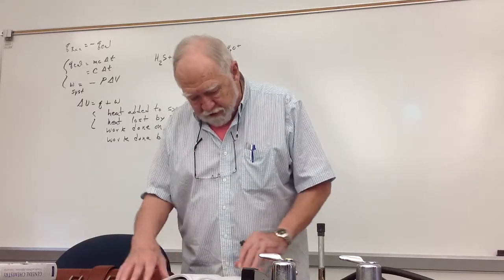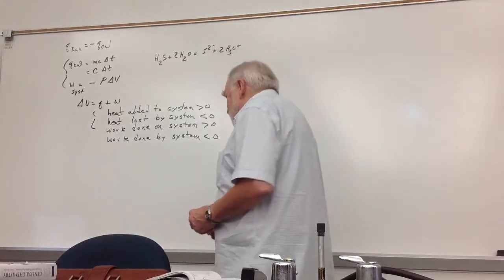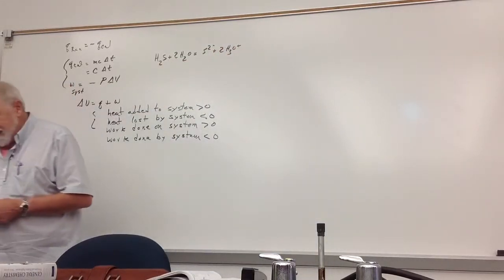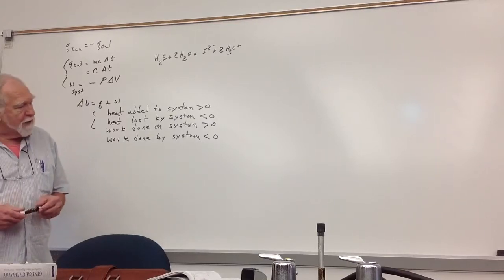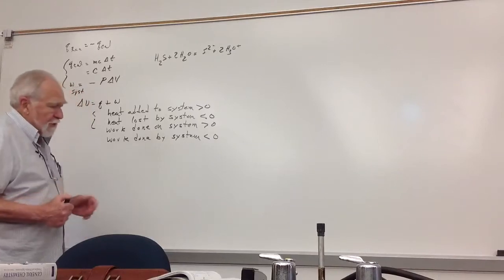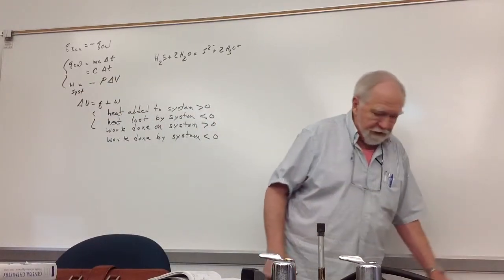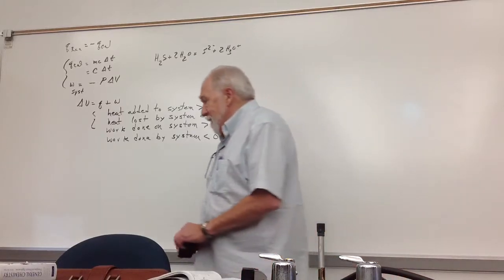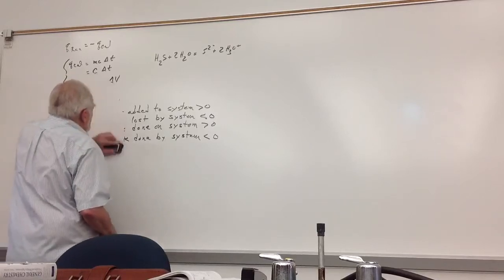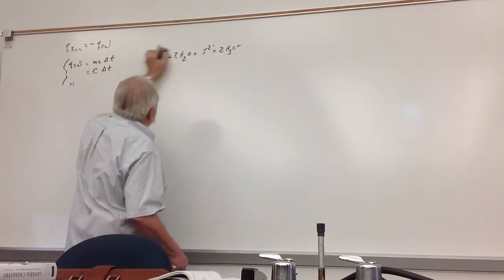and preparing their knowns and getting started on it. And almost everybody is getting to where they want to pick up the unknown for experiment 2. You should have your equations all done by now in your books. As soon as you get your last precipitate for the tin test, you run up here and do your quiz, get your unknown, and go through the unknown and move into experiment 3.